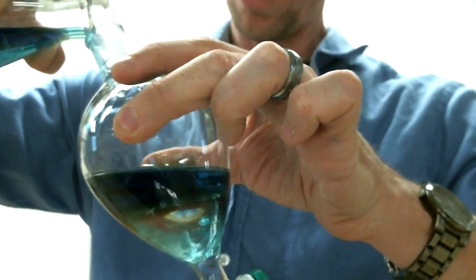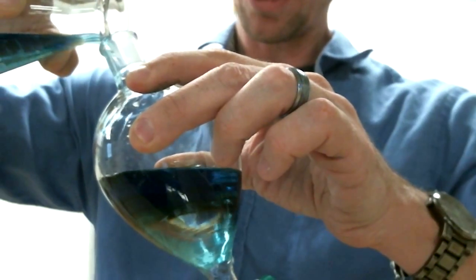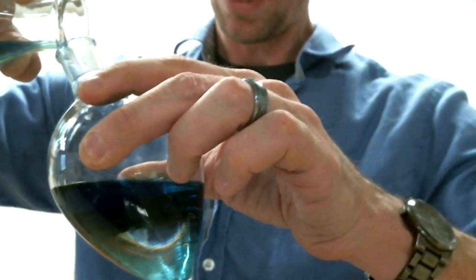Now again, you wouldn't do this during a normal liquid-liquid extraction experiment, because ultimately, as you're about to see, our goal is to mix the two thoroughly. But for now, I'm just going to layer it on there gently so you can see that the two solvents are definitely immiscible and create two different phases. A little bit of a mess there, but not too bad.